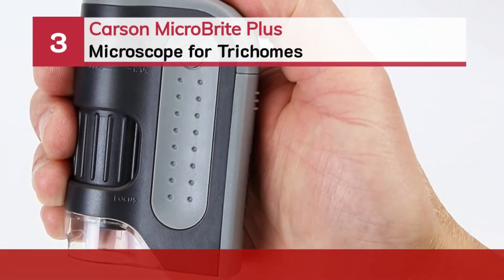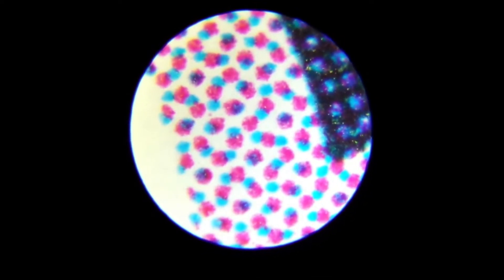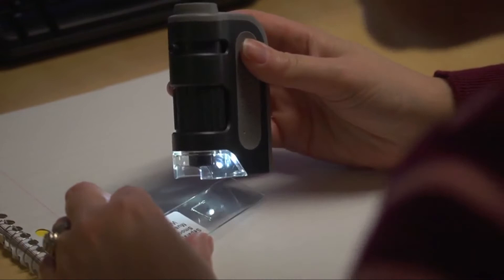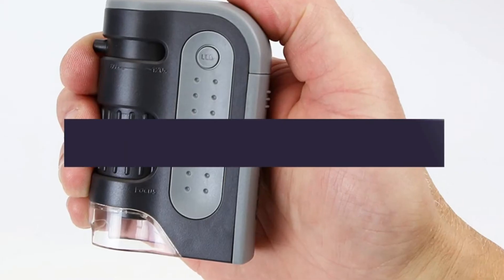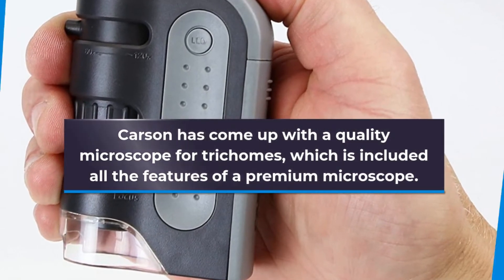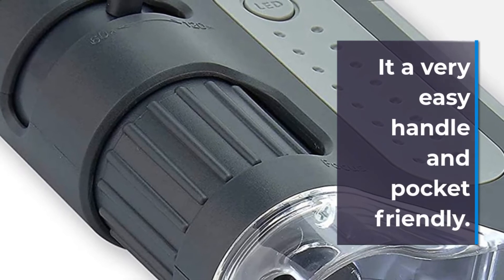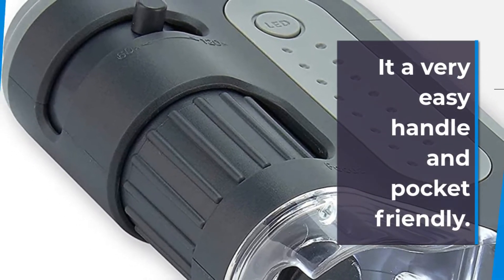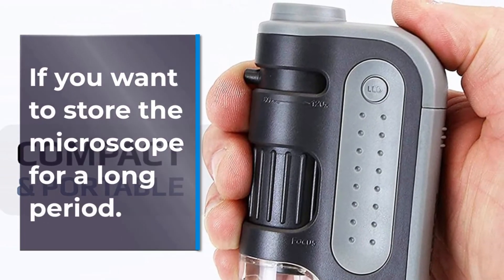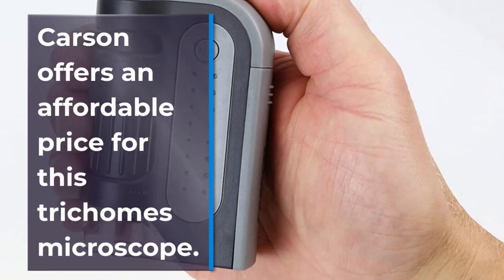Number 3: Carson Microbrite Plus Microscope for Trichomes. Carson has come up with a quality microscope for Trichomes, which includes all the features of a premium microscope. It is very lightweight, compact, and portable by design, and very easy to handle and pocket-friendly. If you want to store the microscope for a long period, it is a great option. Carson also offers an affordable price for this Trichomes microscope.